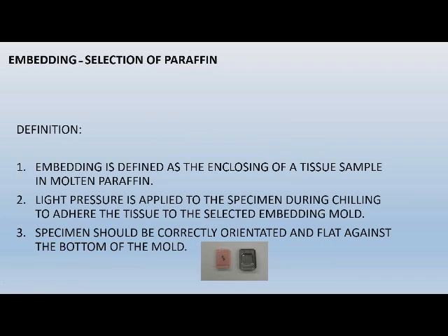Now there are many ways to define embedding. You can embed a rock in a wall, you can embed a footprint in concrete, but in histology, embedding is defined as the enclosing of a tissue sample in molten paraffin. And then we apply light pressure to the specimen during chilling so that we can adhere the tissue, you've all done this, to the bottom of this.